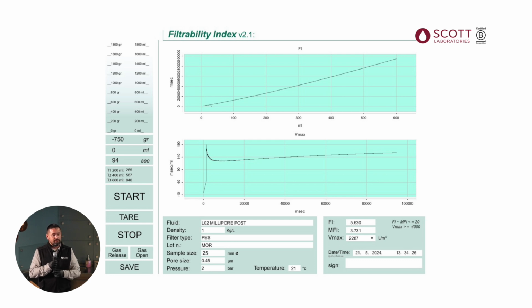In this case, FI is 5, that's great, but modified is lower than the initial FI. So what that tells us is that wine, that day one, is still a good filterability value, but it's going to take that wine a little bit of time to find its way through the filters, right? And once it finds its way through the filters, it's going to level itself out. With modified being low, I would expect that wine to bottle for long periods of time. So maybe you're bottling a wine, it's taking you multiple days, multiple weeks. I still encourage you to test filterability daily, but if your modified is lower than your initial FI, that's a great sign that you're going to be able to bottle.